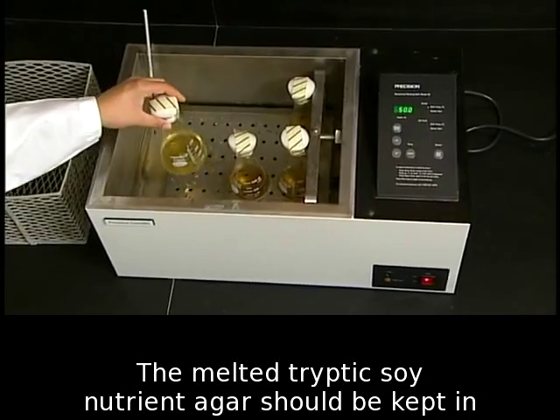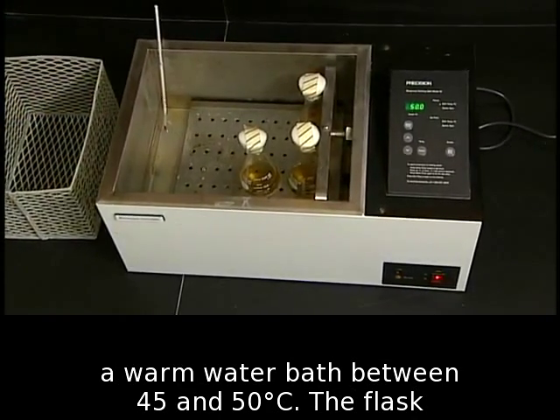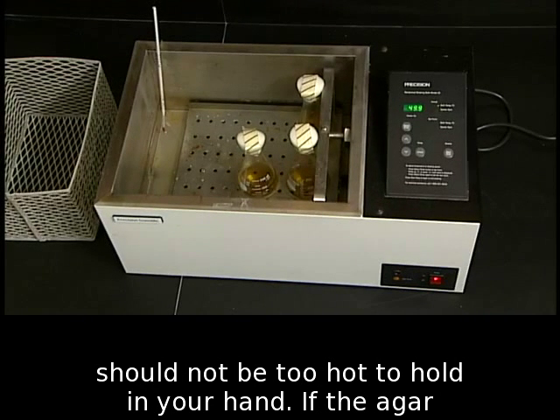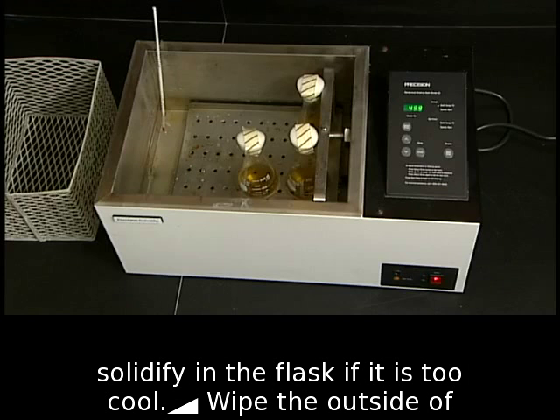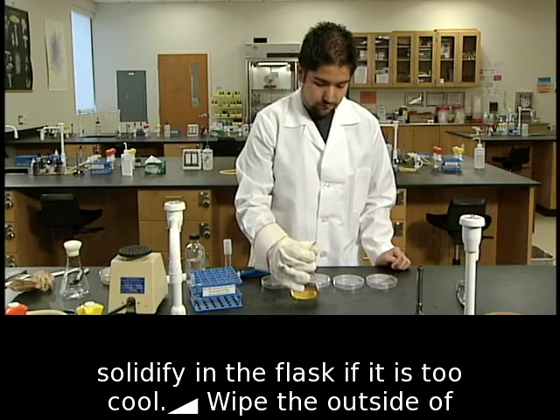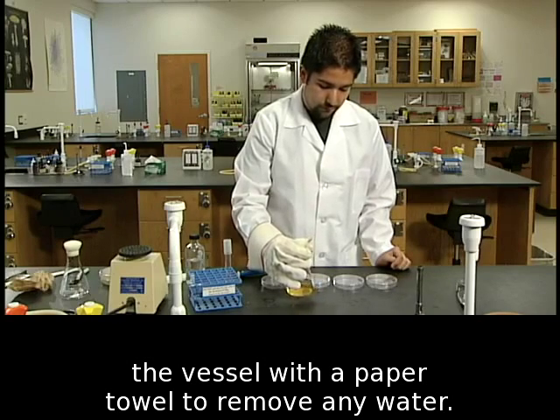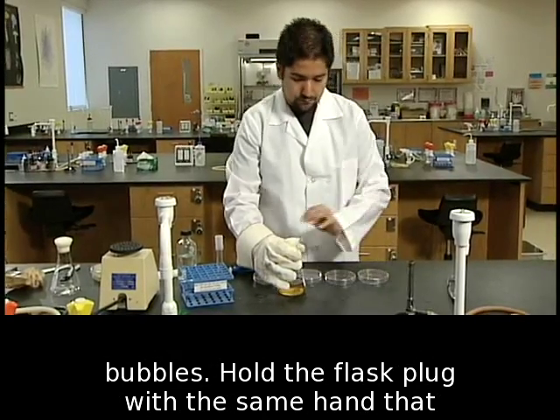The melted tryptic soy nutrient agar should be kept in a warm water bath between 45 and 50 degrees Celsius. The flask should not be too hot to hold in your hand. If the agar is too hot, it will kill the bacteria, and the agar will solidify in the flask if it is too cool. Wipe the outside of the vessel with a paper towel to remove any water. Gently swirl the nutrient agar, taking care not to make bubbles.